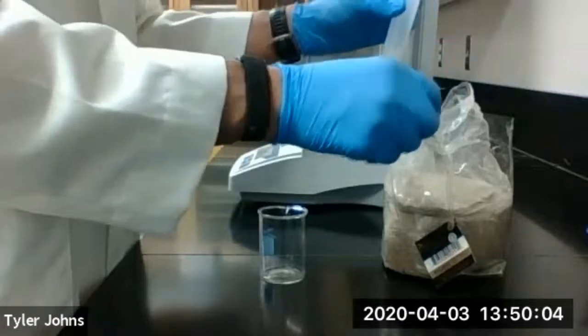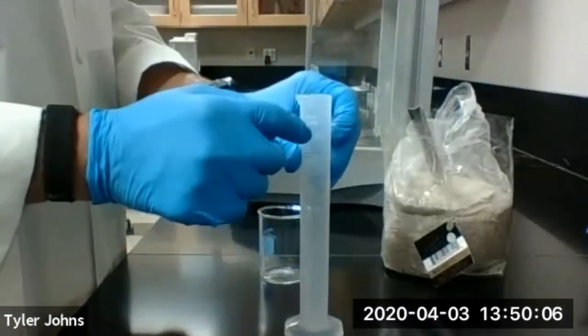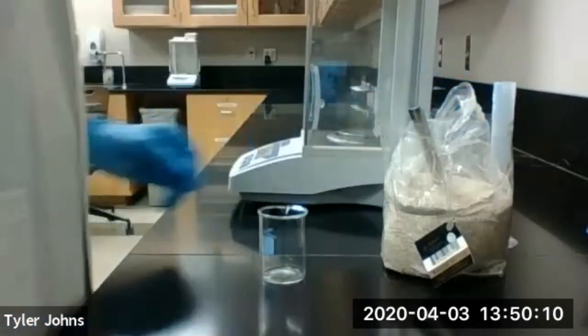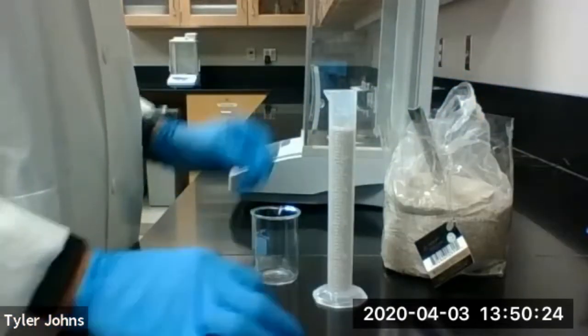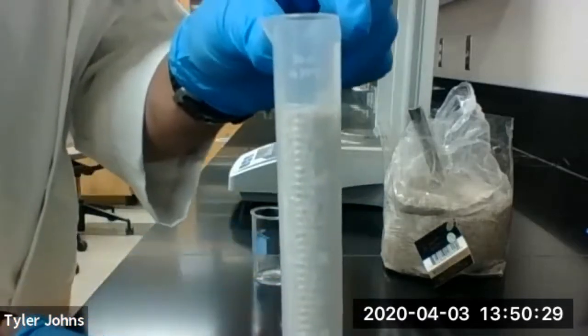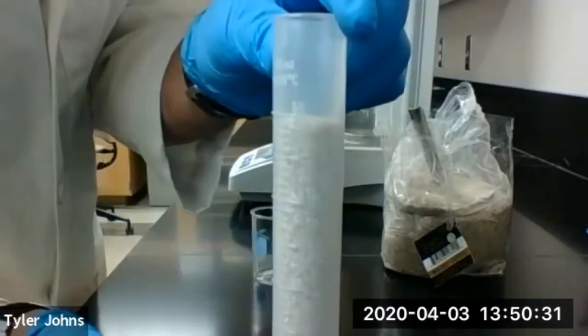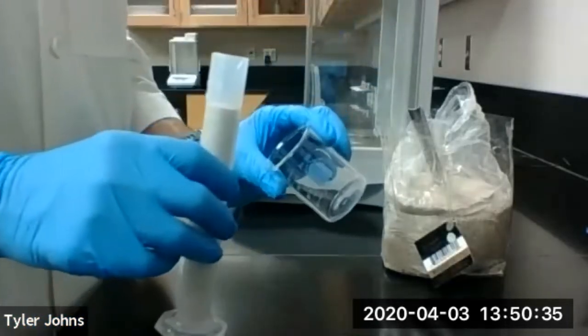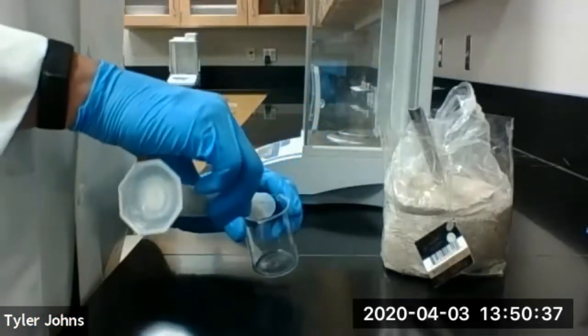So next we need to transfer 50 milliliters of sand into the beaker. So I'm going to fill this 50 ml graduated cylinder up with sand and transfer it into the beaker. So I filled the 50 ml graduated cylinder with sand. So we have 50 milliliters of sand now. We're going to transfer this into our empty 100 ml beaker.